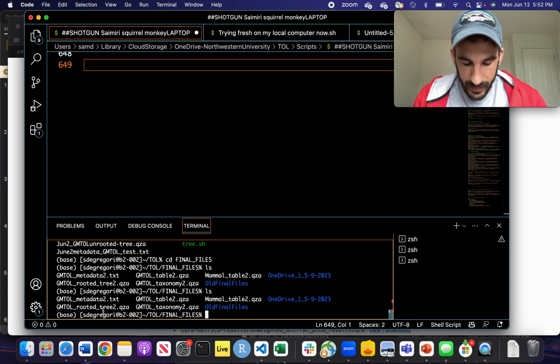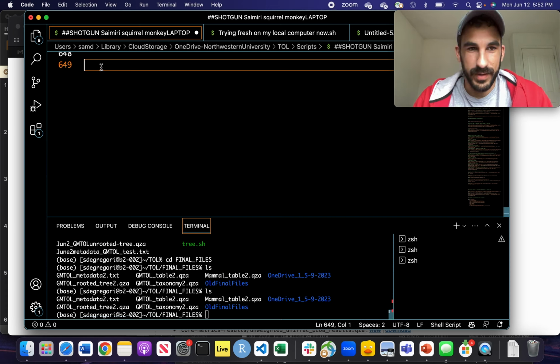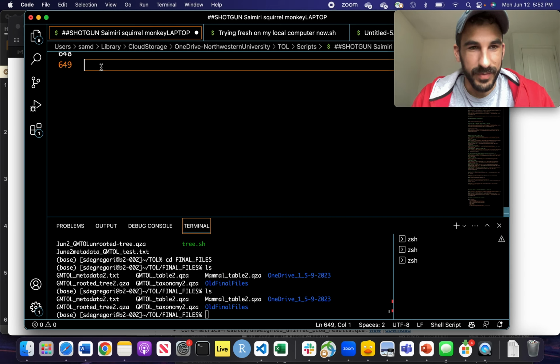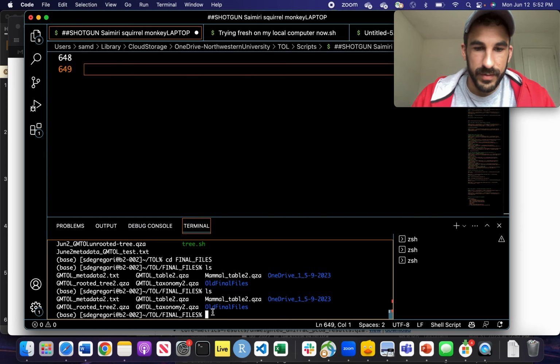So let's actually see. I mentioned GitHub Copilot, which has been working great for me. Let's see if GitHub Copilot can fill in the code. But if you're not using it, don't worry. You'll be able to copy this code. Okay, well first I have to activate Qiime. So obviously conda activate Qiime2 23.2.